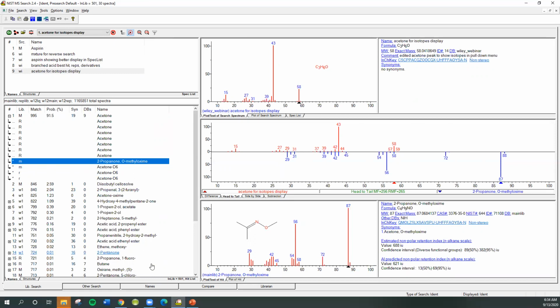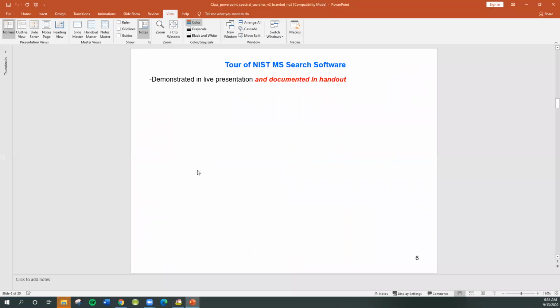So let's go back to the slides and see where we're at here. So we've done our basic tour here.